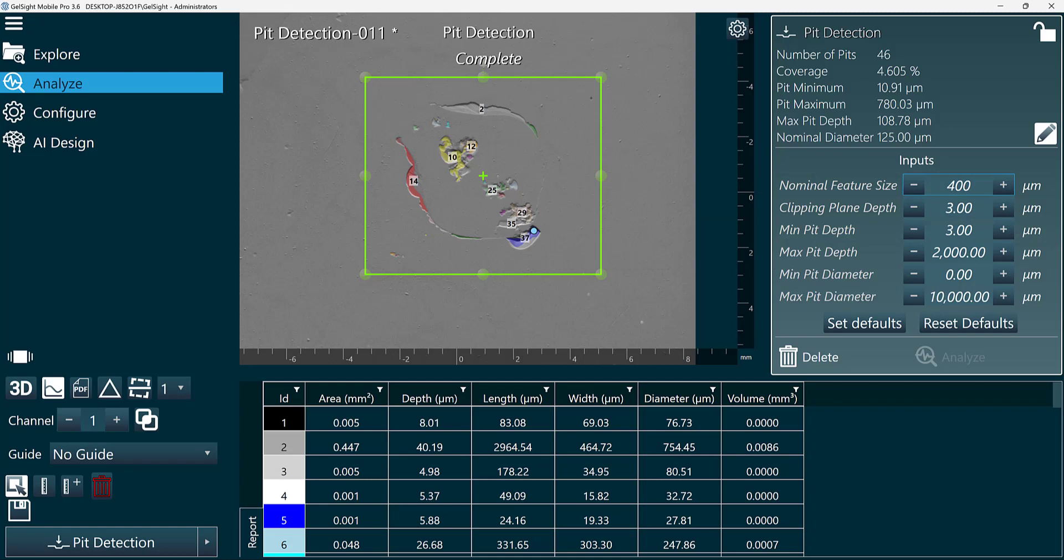The rest of the input parameters are used for filtering, so they can be used to ignore pits outside of certain specifications.